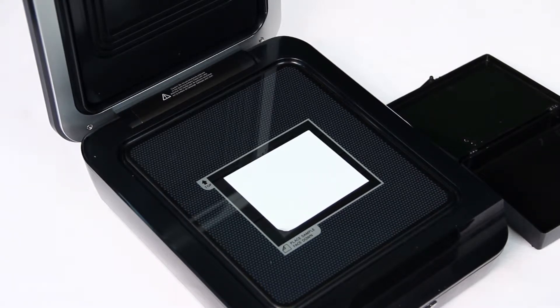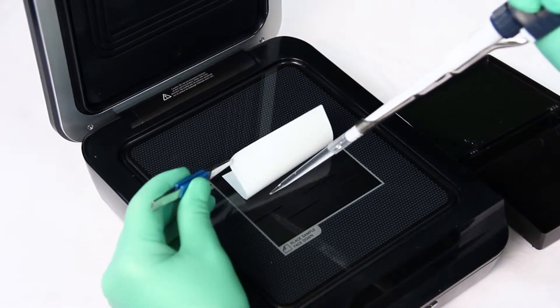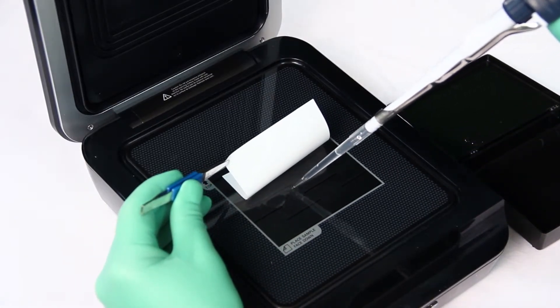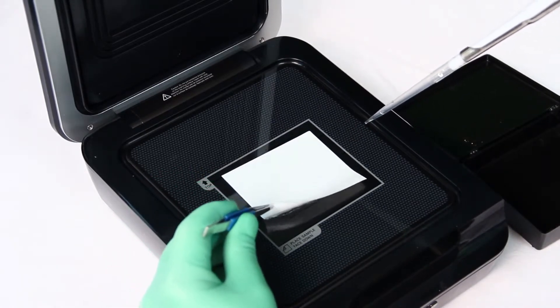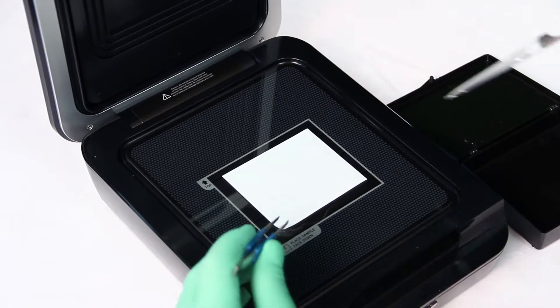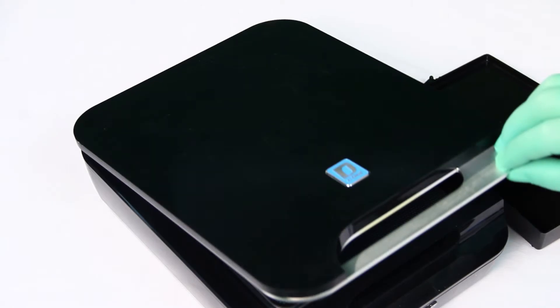The blot can be placed directly onto the scanner surface either before or after incubation with a chemiluminescent substrate. If substrate has not been added to the blot, you can add substrate directly to the blot on the scanner surface. After the appropriate incubation time for the substrate, you can then scan your membrane.